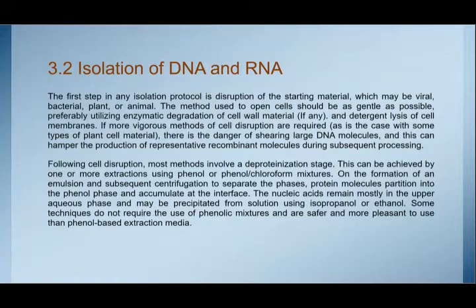The nucleic acids remain mostly in the aqueous phase and may be precipitated from solution using isopropanol or ethanol. Some techniques don't require the use of phenolic mixtures and are safer and more pleasant to use than phenol-based extraction media.